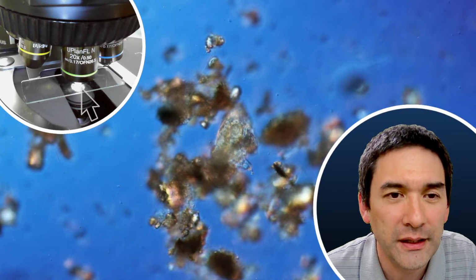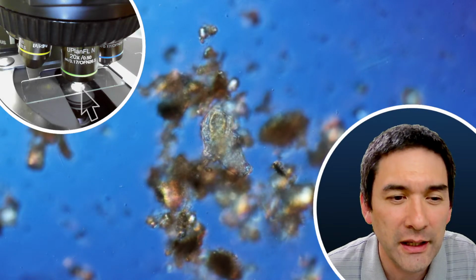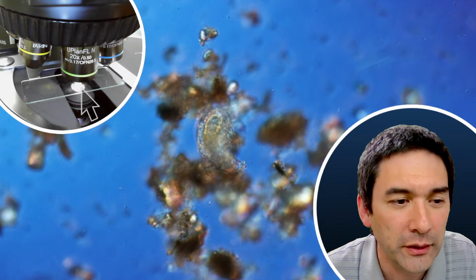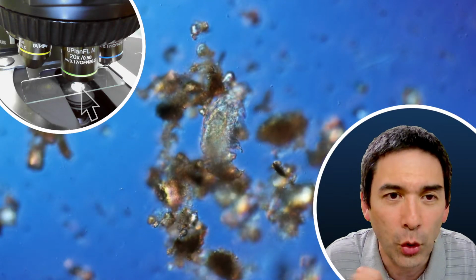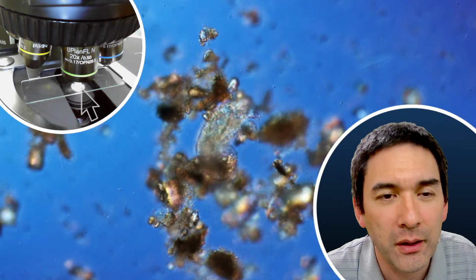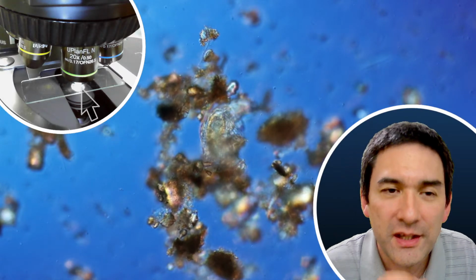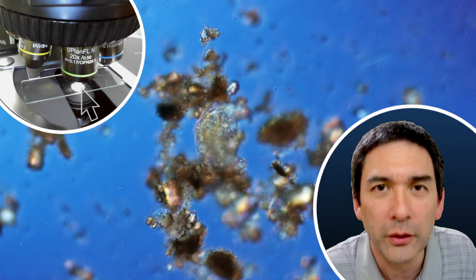That's actually one of the reasons also why they might be a little bit difficult to find, because they like to be around solid material. As I told you already, they like to cling to objects, and they don't move quite as rapidly as some other organisms do. The reason is on a smooth microscope slide, they have a real problem crawling forward.